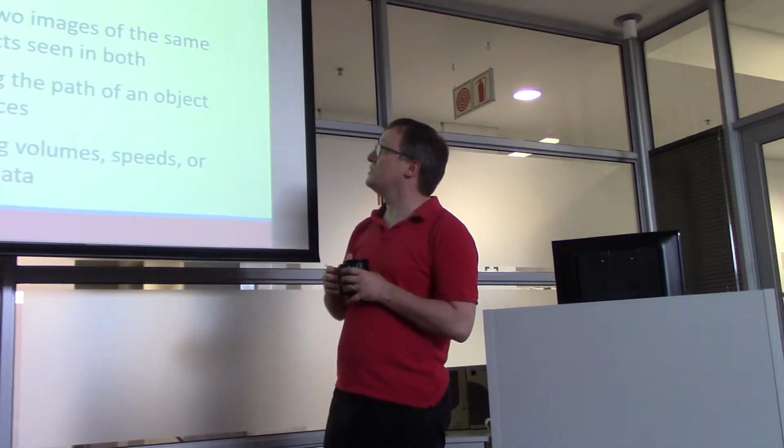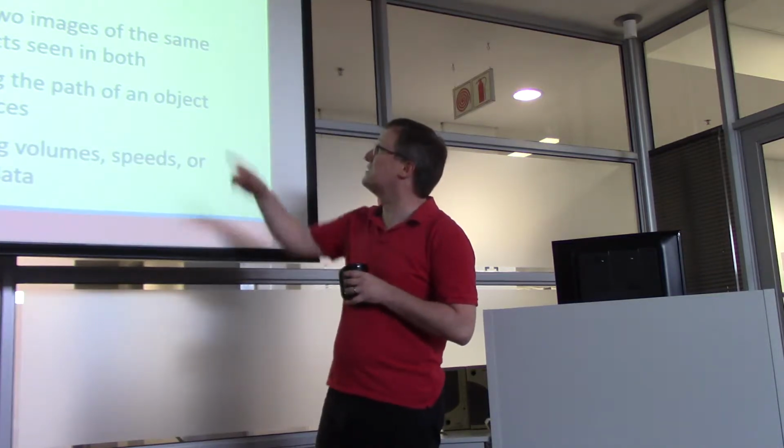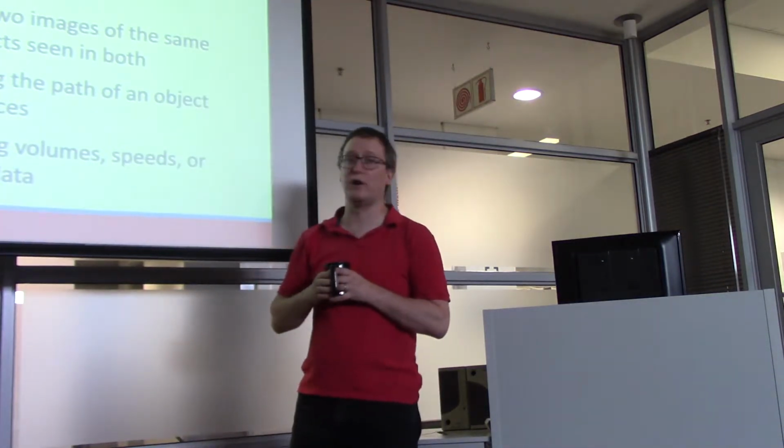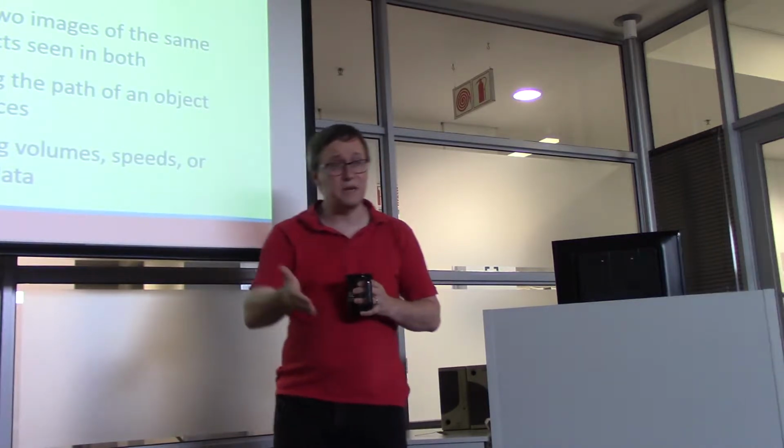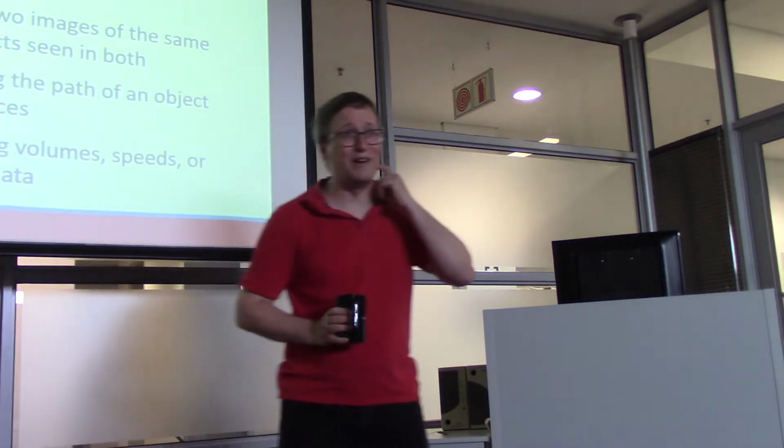Okay, so in image analysis, we frequently talk about segmentation, which is the ability to separate objects and background from their visual field. Just the same as when you're watching the video, I'm hopeful that you're noticing motion and animation in the teacher and probably ignoring whether people are walking by in the background, right? I want to be the star of my own video.